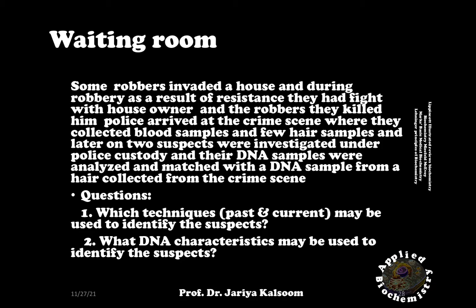The sorted double-stranded DNA fragments were then subjected to a blotting technique in which they were split into single strands and transferred to a nylon sheet. These fragments were subjected to autoradiography in which they were exposed to DNA probes, which are pieces of DNA complementary to minisatellite DNA and that were made radioactive.